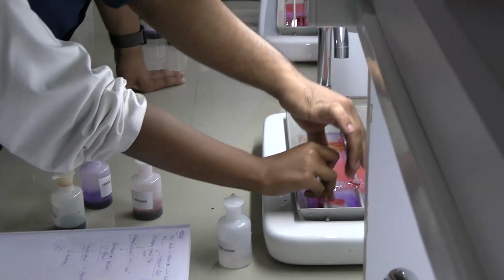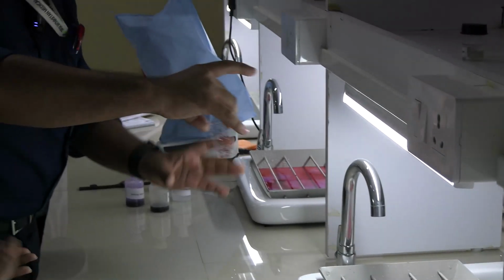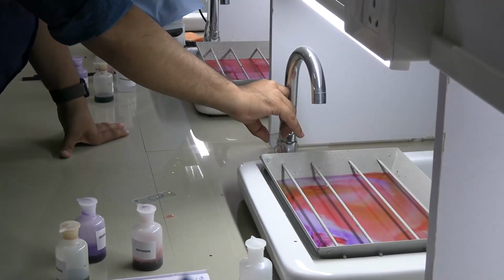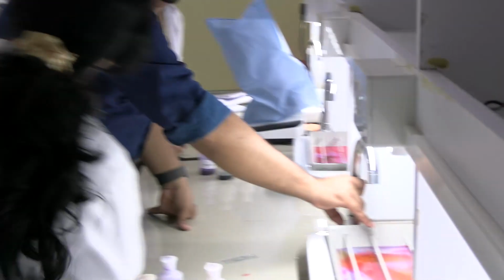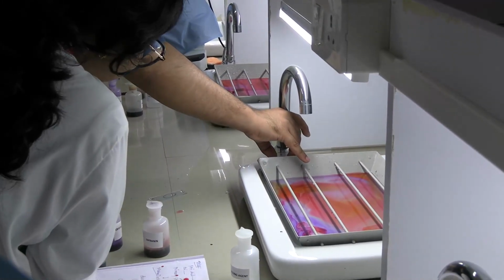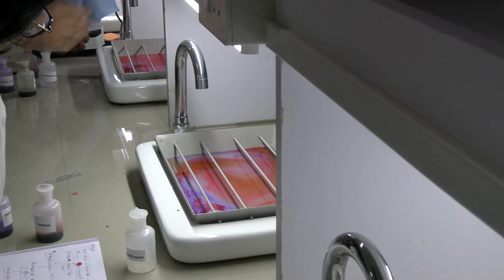So after that, what is the final step? That is, we have to let it dry, okay? So first what we're gonna do, this is a small trick. Come here, don't do this jiggle motion at the beginning. You're gonna put it at this tight spot around here, so that the excess water dribbles down.